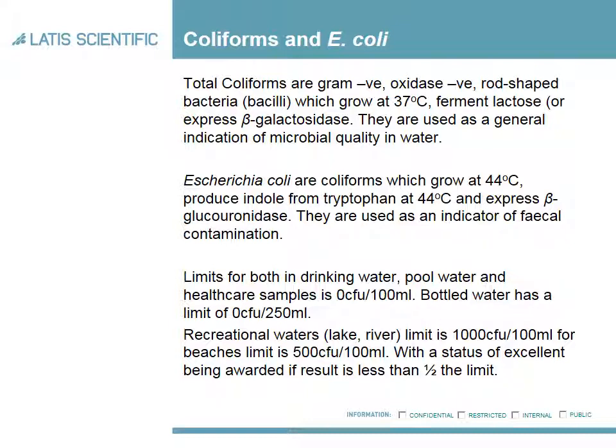However, E. coli is one species within coliforms, and they'll grow at a higher temperature, 44 degrees. They produce indole from tryptophan and express beta-glucuronidase, and these are used as an indicator of fecal contamination. The limit for both in drinking water, swimming pool water, and related things such as spas and hydrotherapy pools is 0 CFU per 100 mls, i.e. they shouldn't be present.